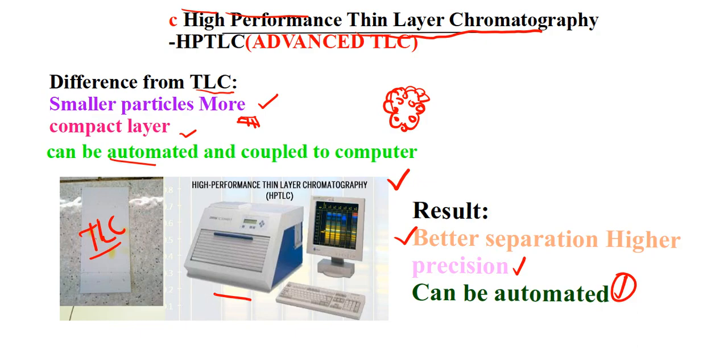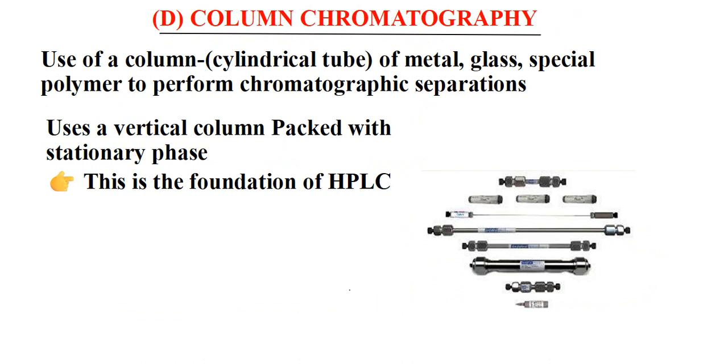Very important. So let's talk about now column chromatography. Here we use the column. This is the introduction: the heart of chromatography is the column. Everything happens in the column, okay? Then different detectors will be used from there. So this is what we call column chromatography. You see, we were using papers, aluminium plates, glass, but now we are using the column as the type of separating technique.